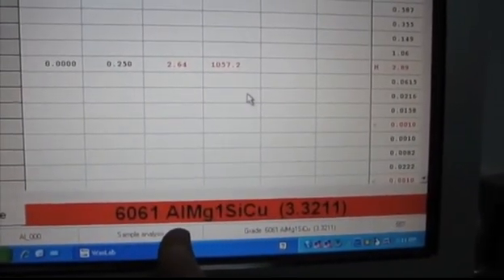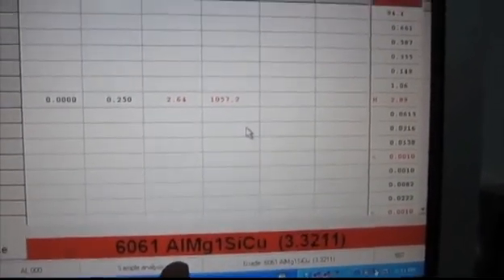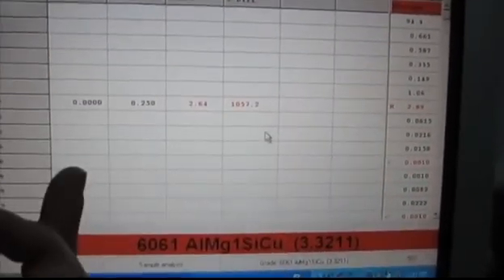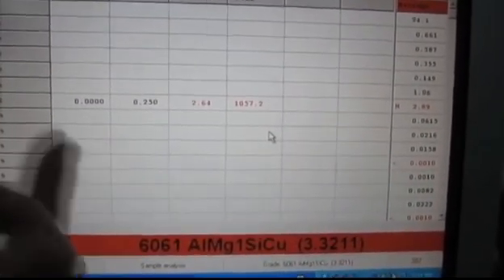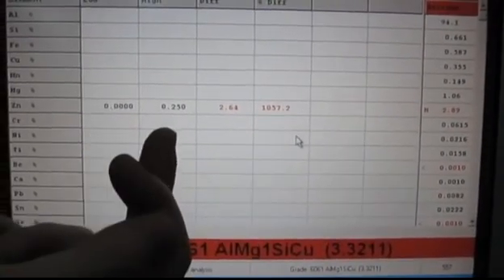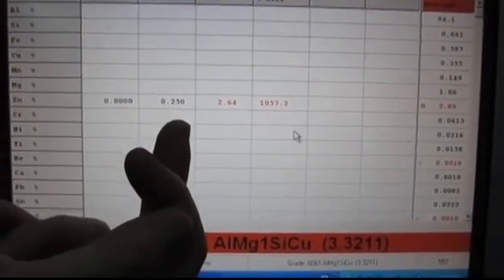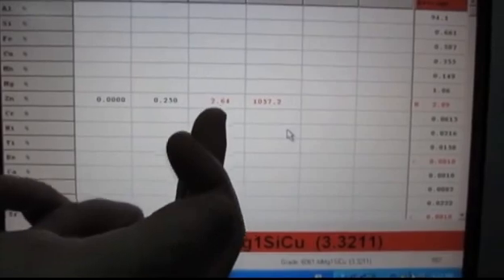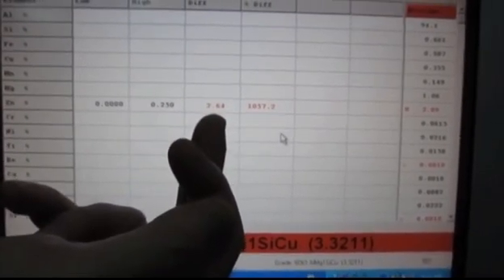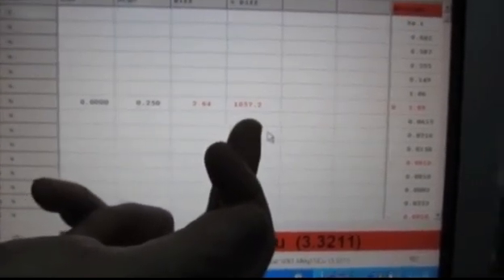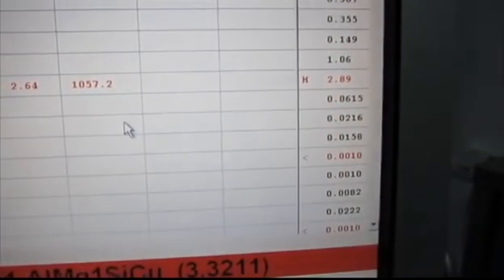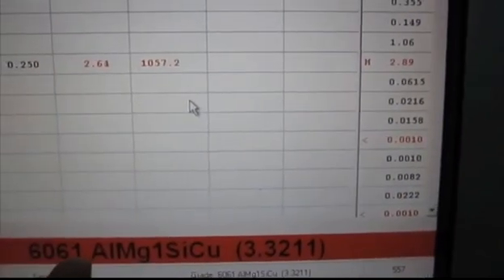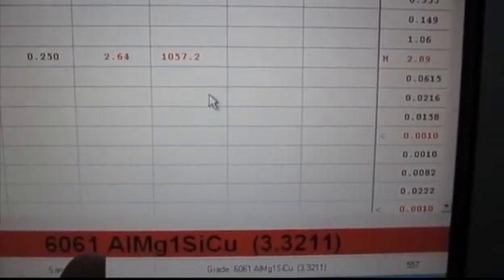Red means it is definitely not 6061. Above it will show us where it is not 6061. The zinc should be between 0% and 0.25%. It's actually 2.64 points above where it should be. That's a thousand percent too high. The actual content, the average content is 2.89%. So we would actually reject this material as being 6061.